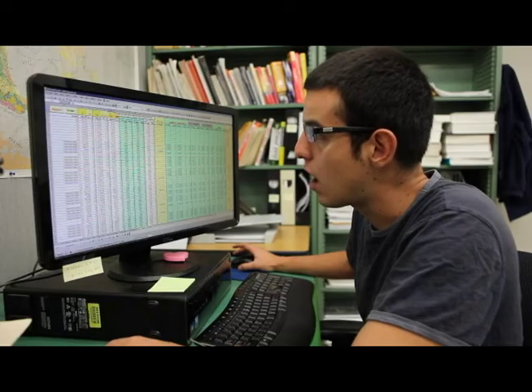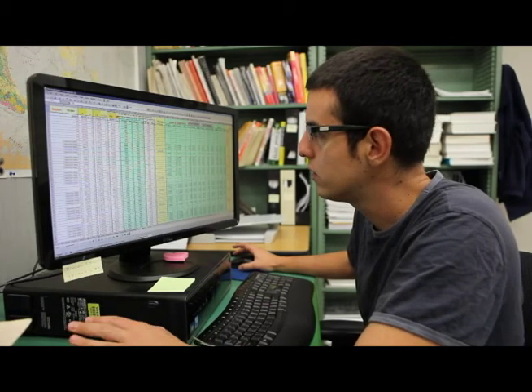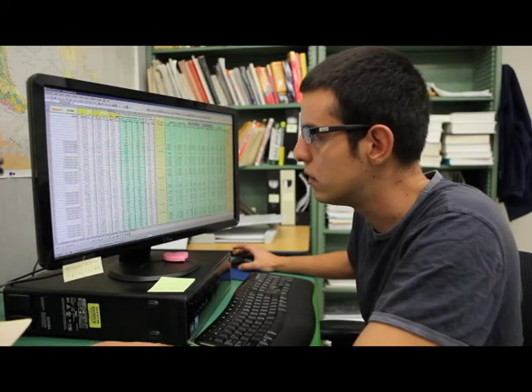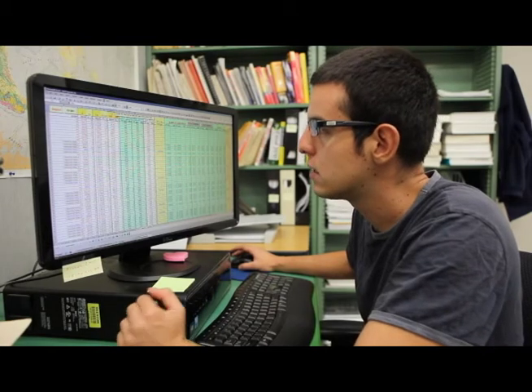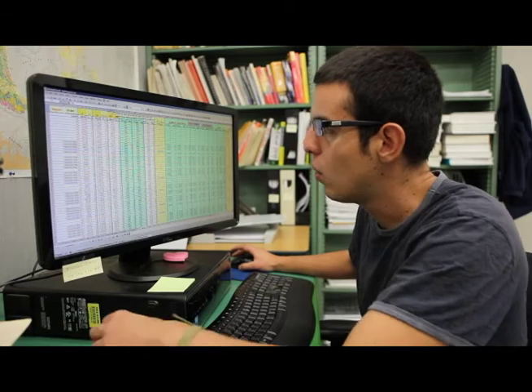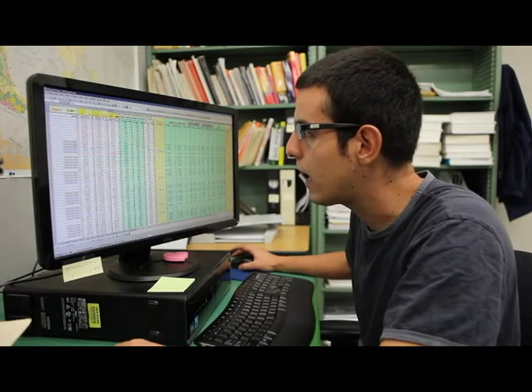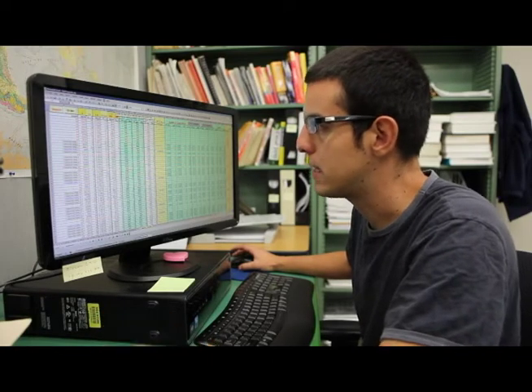It is very common that in a lot of samples you're going to find a big peak right around the age of the Grenville orogeny, that is 1 Ga. So one thing you don't want to do is set this parameter right in the middle of a population, because you can artificially generate two peaks, one by having half of that population use the 206/238 age as the best age, and the other half use the 206/207 age as the best age.